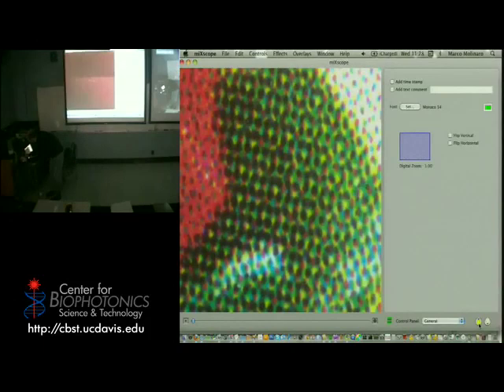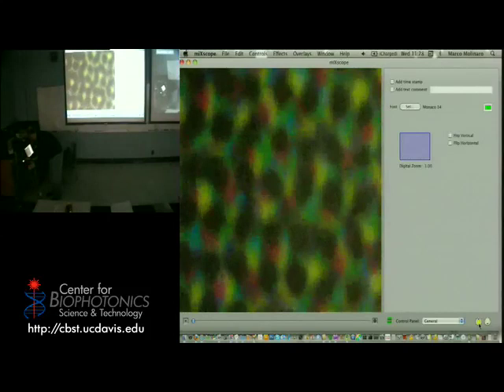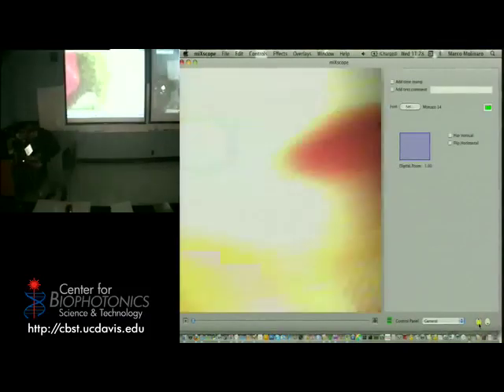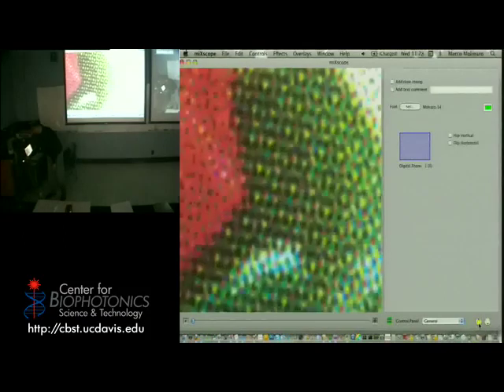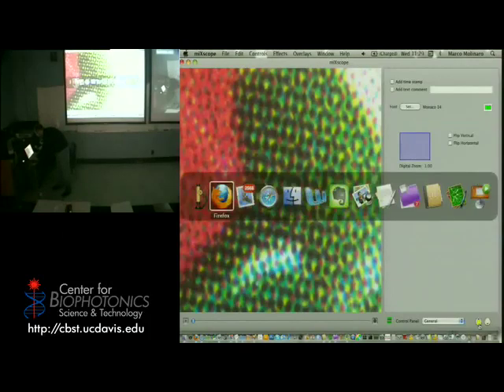And I can go even higher magnification. It doesn't get super sharp, but that's about what you see. And it's clear on the computer. You can see the different colors of dots a little bit better. But this is how all your magazines are done. All your color printing is done. This is how your inkjet printer works, by combining these different colors. And the microscope, by varying magnification, allows me to get closer or farther away from my sample. It allows me to investigate what's going on and see it. And again, I can do light from different directions and see different things.